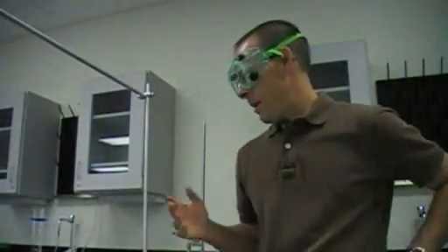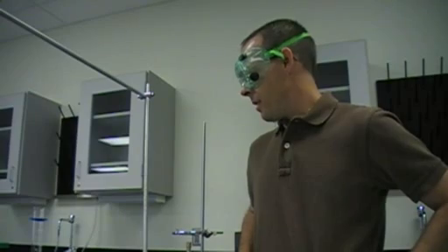All right, welcome to my lab equipment demonstration and explanation. The first thing we're going to look at is different ways we can measure liquids.